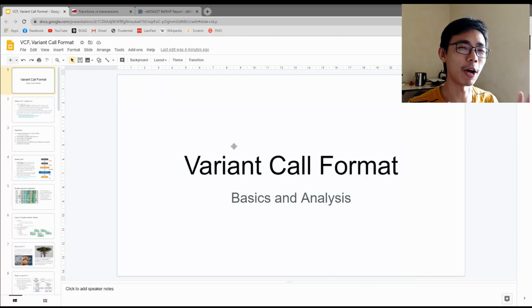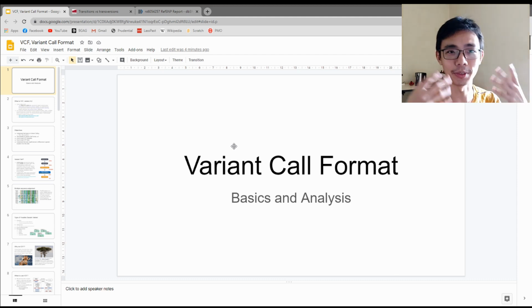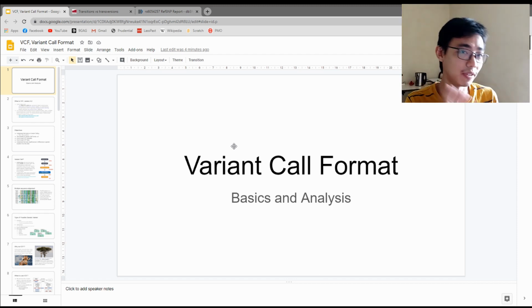So today we are talking about variant call format. This is part one of a multi-part video series on variant call format. I don't know how many parts there are, but it's going to be roughly around the idea of variant call format. The first part will be about the basics of variant calling, the reason why we need to do variant calling, and why variant call format is the ideal format to use in this case.